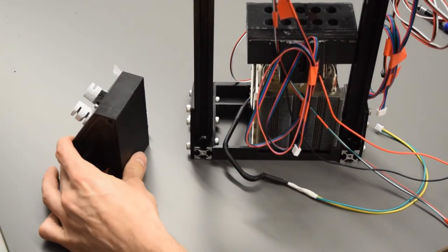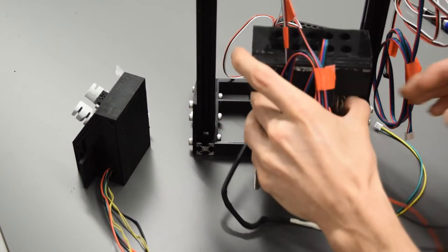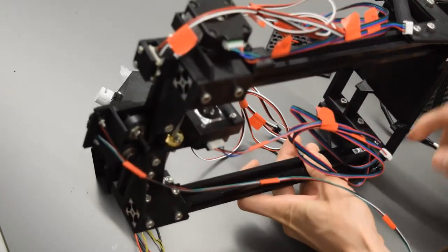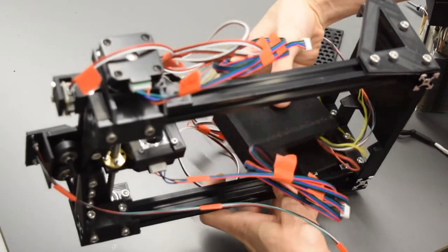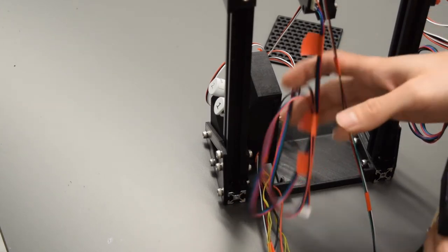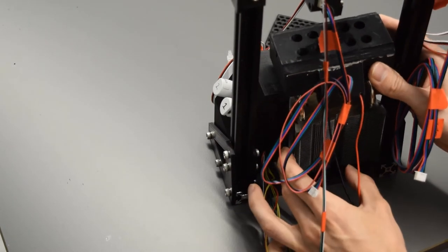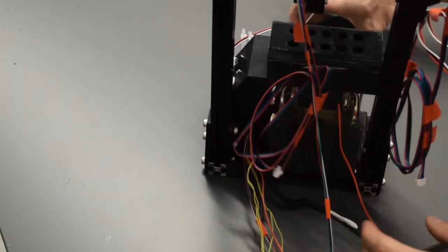So once you have your pump housing assembled here, we can get it right on the Cartesian system. So we're just going to take the sample block off, put that back on in a second, and then I'm going to tip this right on its side so I can get at these two T-nuts that we left in here. And this is going to go in right like this. Awesome, tighten up those screws. Got all the wiring coming out the back like everything else, and then we'll just put the sample block right back in. The box here should sit just over the pump housing. Those shouldn't interfere so that the pump housing's all the way at the bottom.